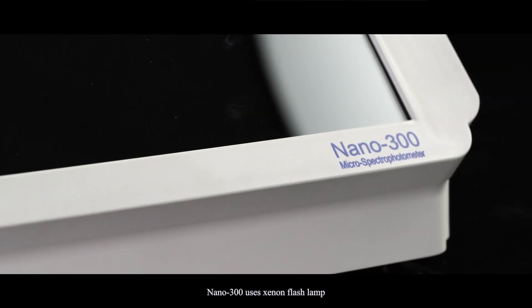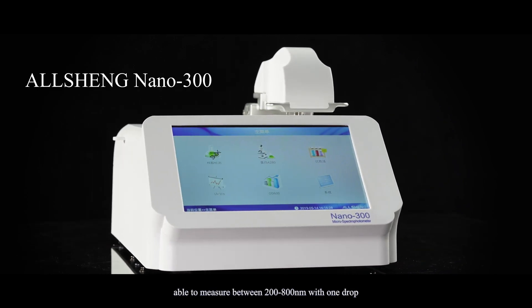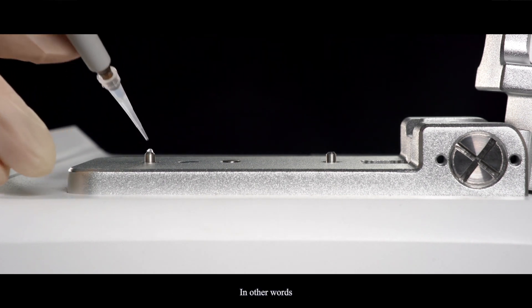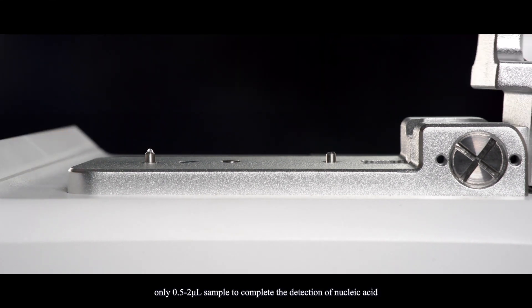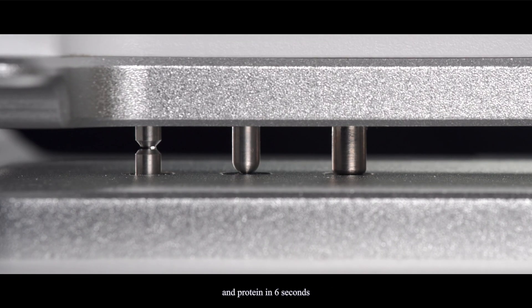Nano 300 uses Xenon flash lamp, able to measure between 200 and 800 nanometers with one drop. In other words, only 0.5 to 2 microliter sample to complete the detection of nucleic acid and protein in 6 seconds.